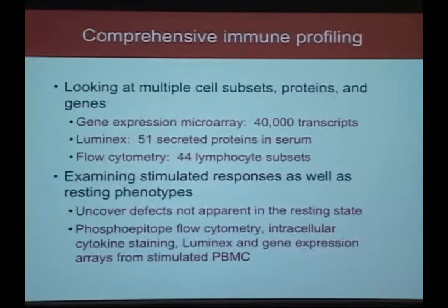Now, in order to achieve this one-stop shop concept, we've tried to build some relatively comprehensive assays that we do on a regular basis that we consider our standard assays. And we kind of have to do this because if we built a custom assay for each new project that came along, we would never get anywhere. We'd spend all our time in assay development.